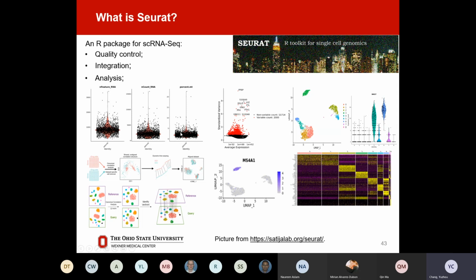And the last figure is the percentage of mitochondrial genes, which is important for quality control because we have some assumptions I will introduce later. The y-axis is the percentage of those mitochondrial genes. So if we observe that some mitochondrial percentages are very high, do we need to remove them? Yes. If we observe that some cells express a high percentage of mitochondrial genes, that means those cells have died or are dying. The mitochondrial gene percentage can reflect the viability of the cell. Okay, good to know. Thank you.